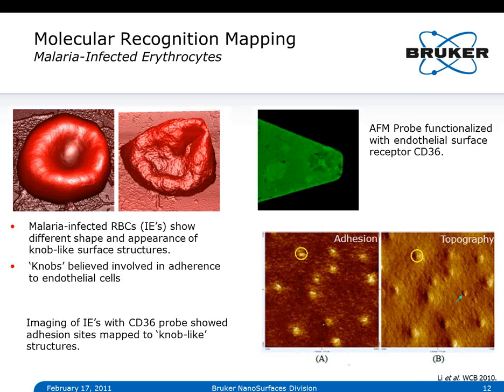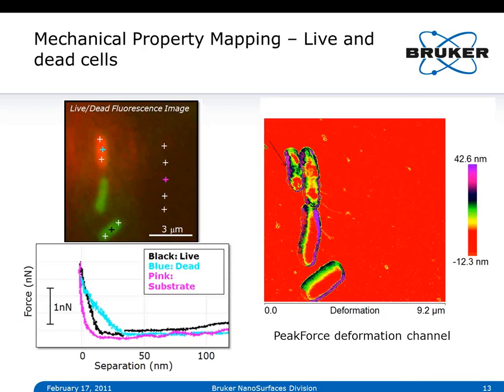If you want to go ahead and of course do single force curves, you can still do that and verify the measurement, but it's just very convenient to do these mapping information because you don't have to go in by hand and create these maps and maybe accidentally miss an object. Let's talk about missing an object.